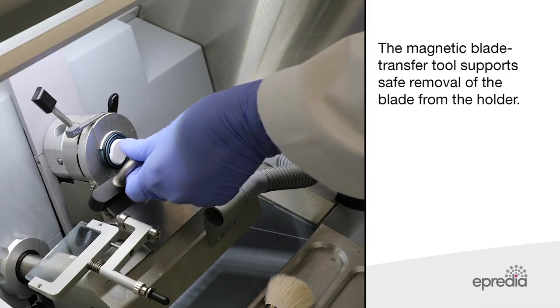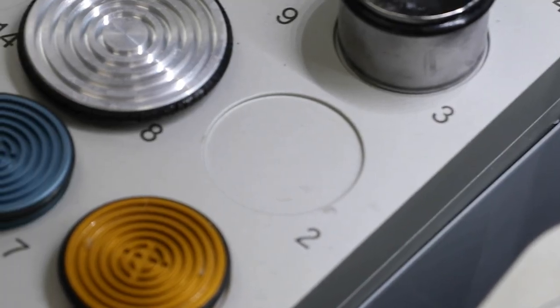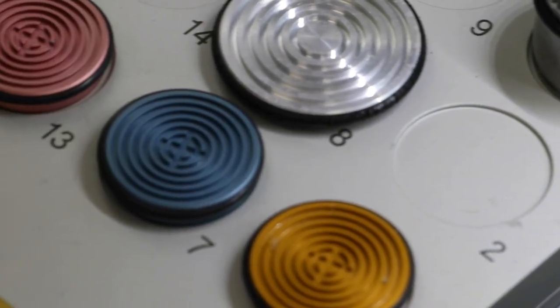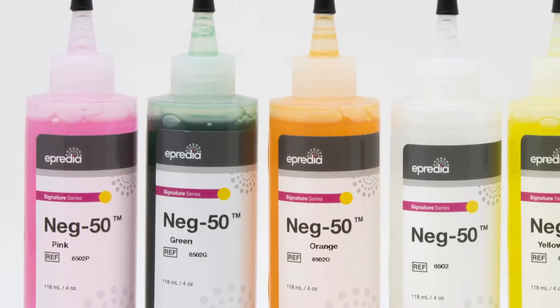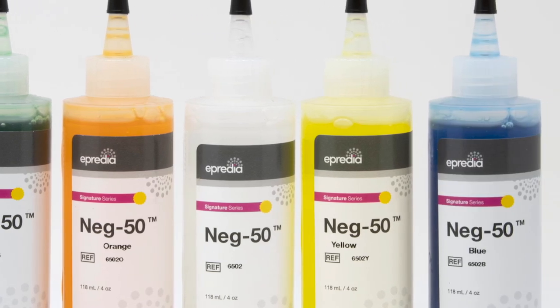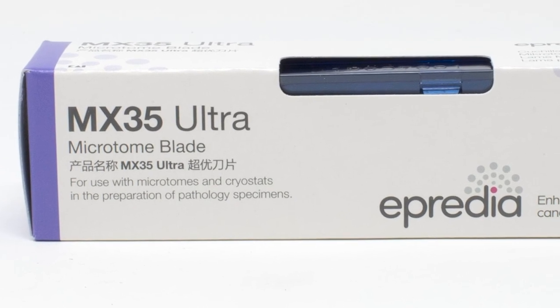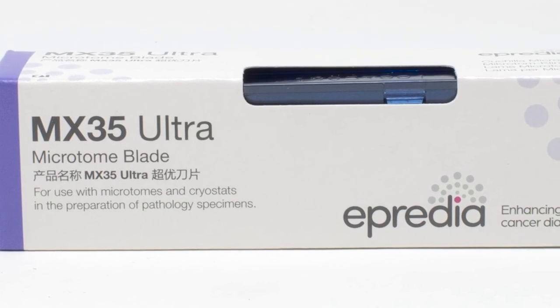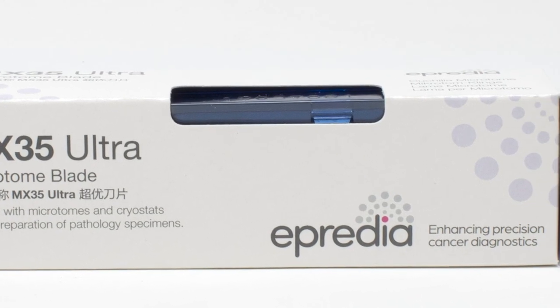The magnetic blade transfer tool supports safe removal of the blade from the holder. Apredia offers the complete solution for lab sectioning samples, including specimen stages and frozen section media in a range of different colours to help with sample tracking. Apredia's ultra microtome blades are manufactured with proprietary pink steel hardening technology and a unique blade coating that delivers outstanding sectioning performance, durability and consistency.